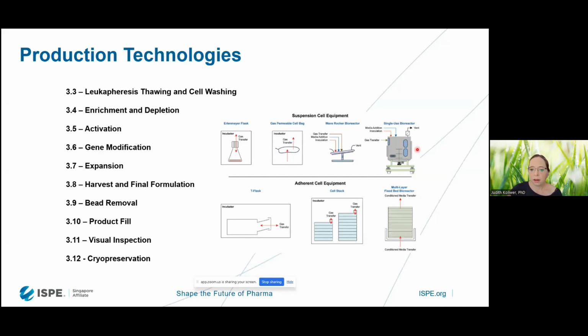Another thing that we really feel is very important when it comes to the bioreactors particularly is the measurement of metabolites. So I think most processes that have been accepted for approval over the last years really go for a daily cell count. We measure the viability using the classic cell counters. But of course, now we also have bioreactors that do inline measurement of metabolites, and with that we can improve and increase our process control.